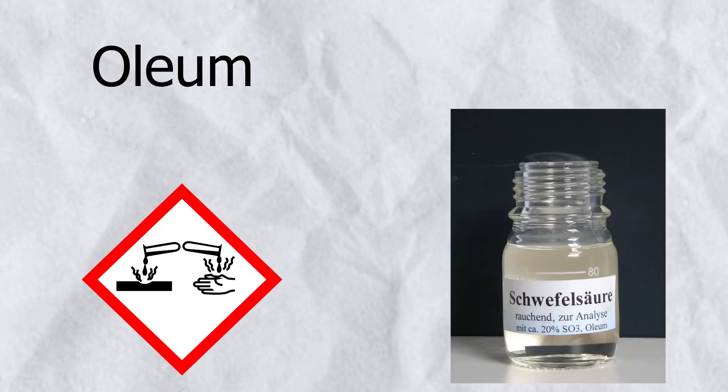In today's video, I'm going to be showing you how you can make oleum from over-the-counter products.